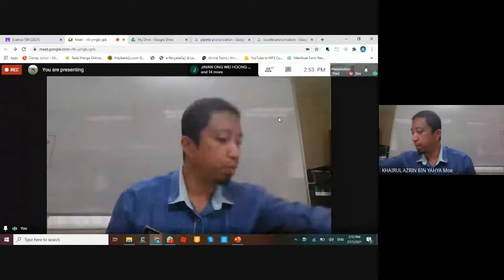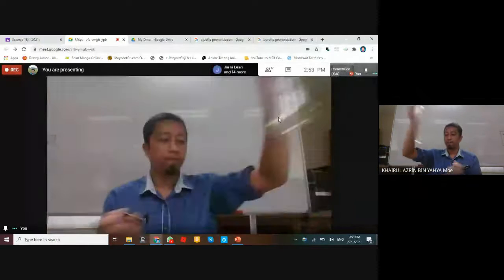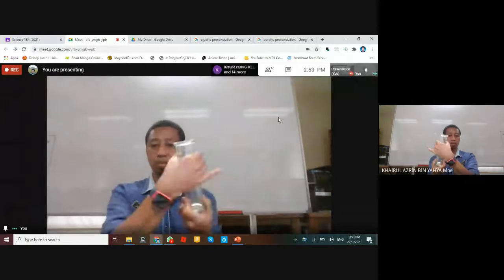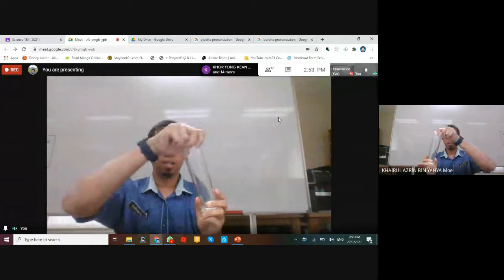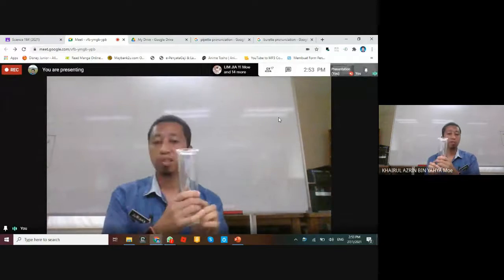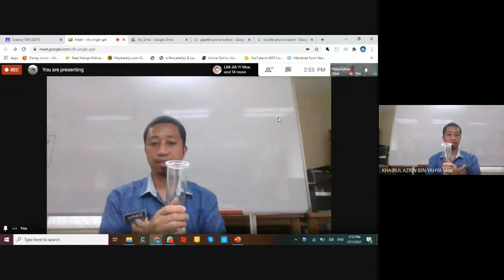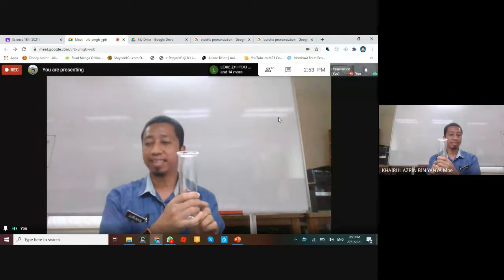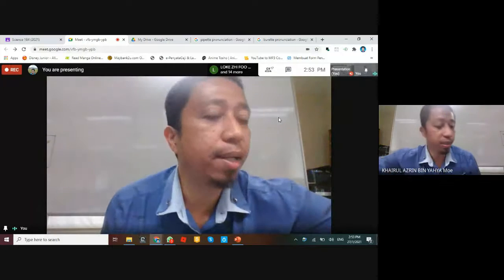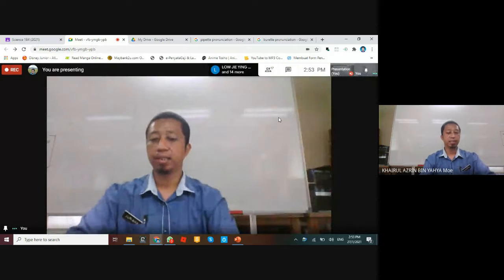What else? One more thing. Yeah, this one. No scales, empty, zero scales here. So this is what we call a gas jar. This is not for liquid. This is for gas, to contain gas. So that's all the apparatus that I brought today to my class.